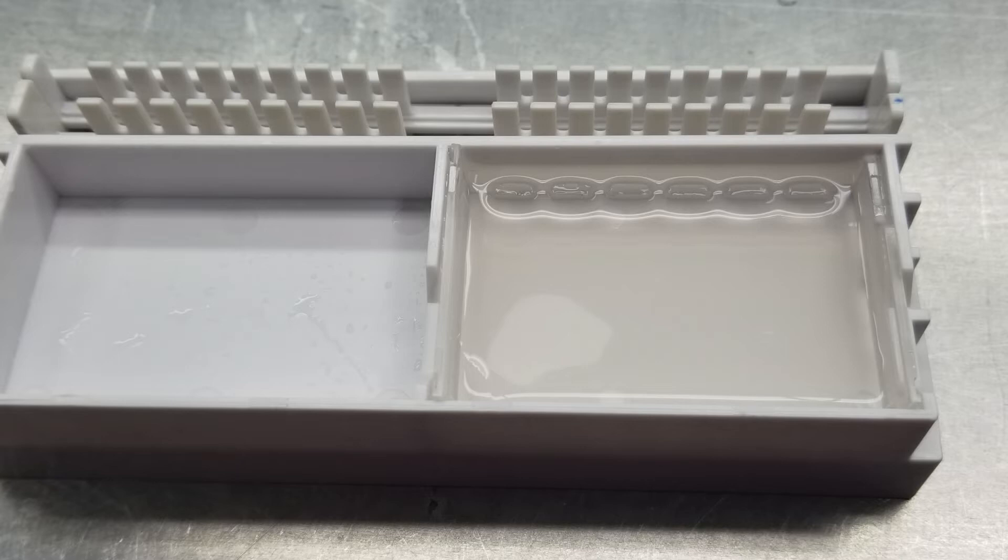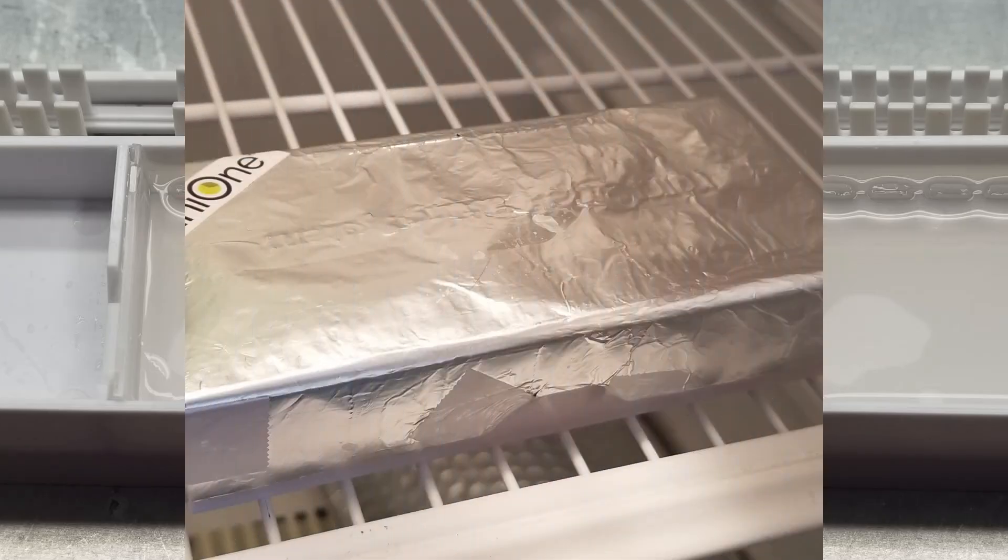If you want to store the gels overnight, leave the gels and casting trays in the casting stand. Add some buffer to them, the same type of buffer used to run the gel, and make sure the wells are filled first, then add 1 milliliter of the buffer to the surface. Rock the casting system slightly to make sure the buffer is spread across the entire surface. Place the cover over the casting stand and store at 4 degrees Celsius.